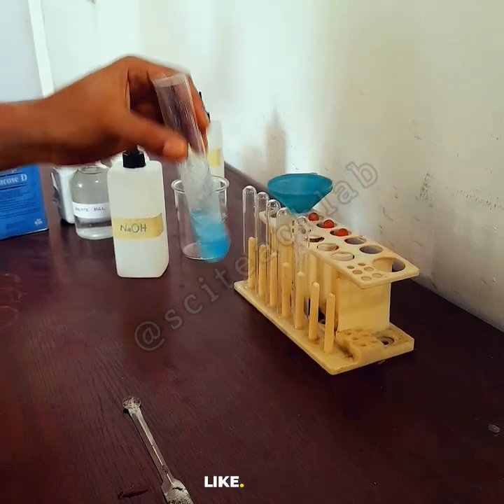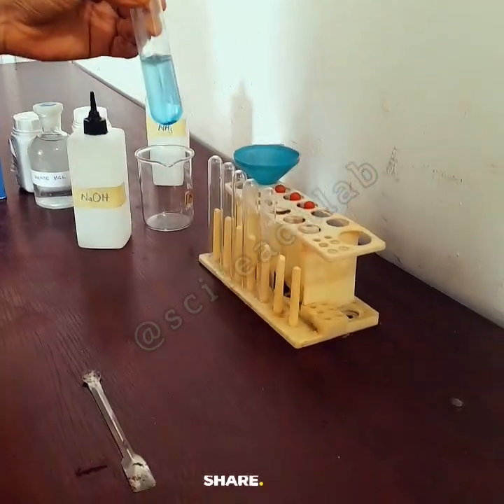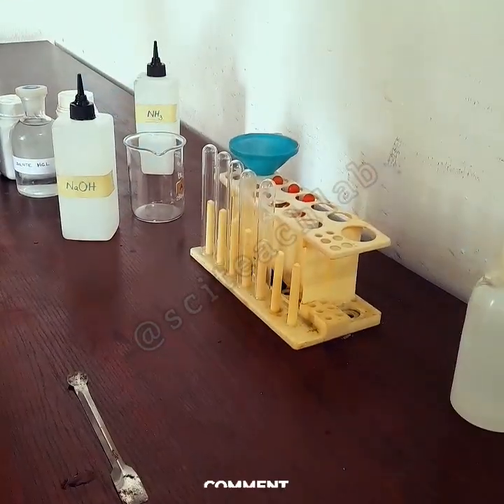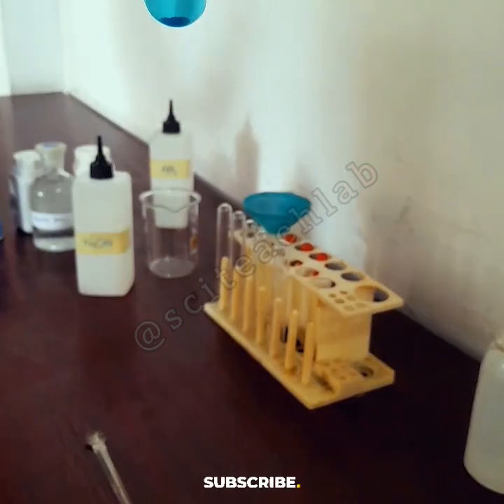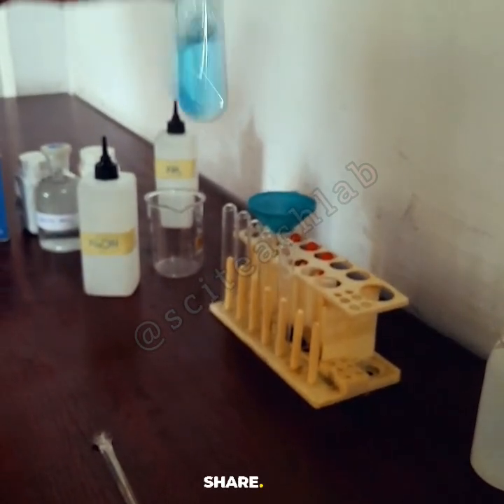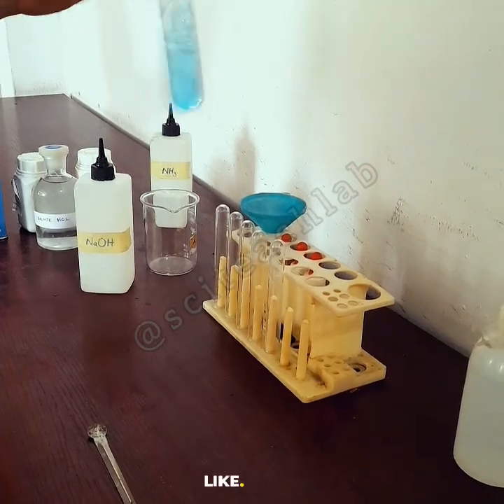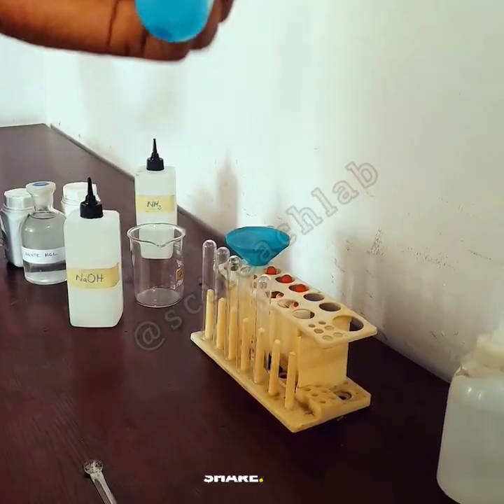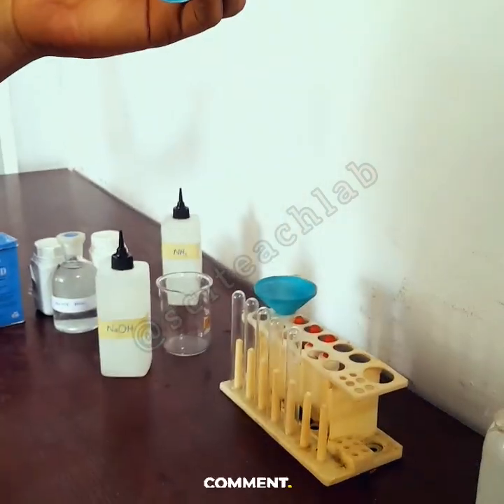If you try to dissolve and it doesn't dissolve, you may need to filter. You may need to use a filter paper and a funnel to separate the residue from the filtrate. But if after adding the exact amount of distilled water you were asked to add, it dissolves, then you carry out your practical. You don't need to filter anything.